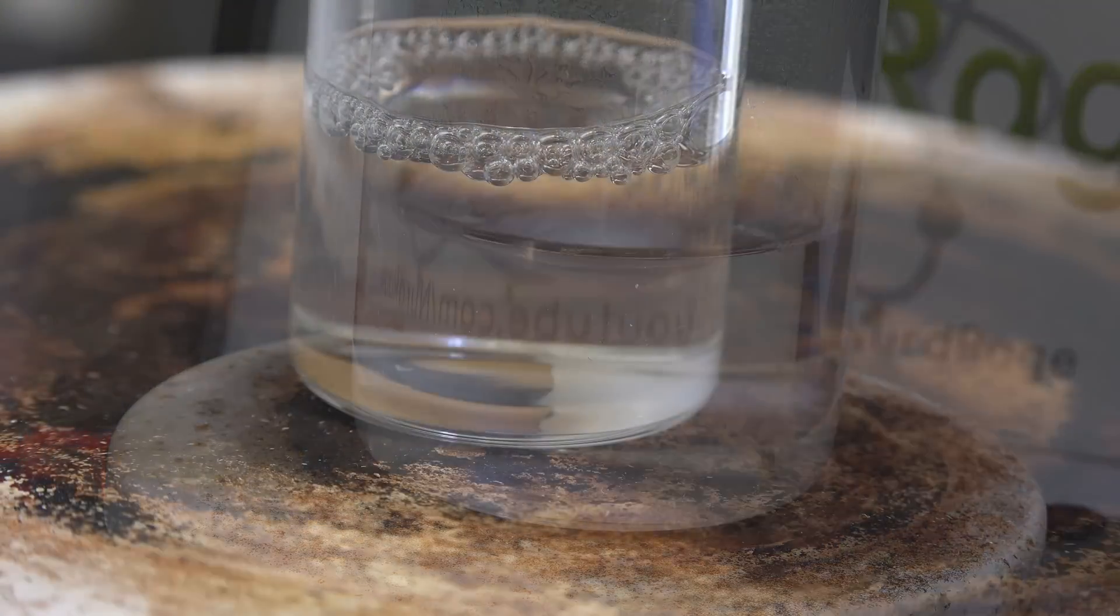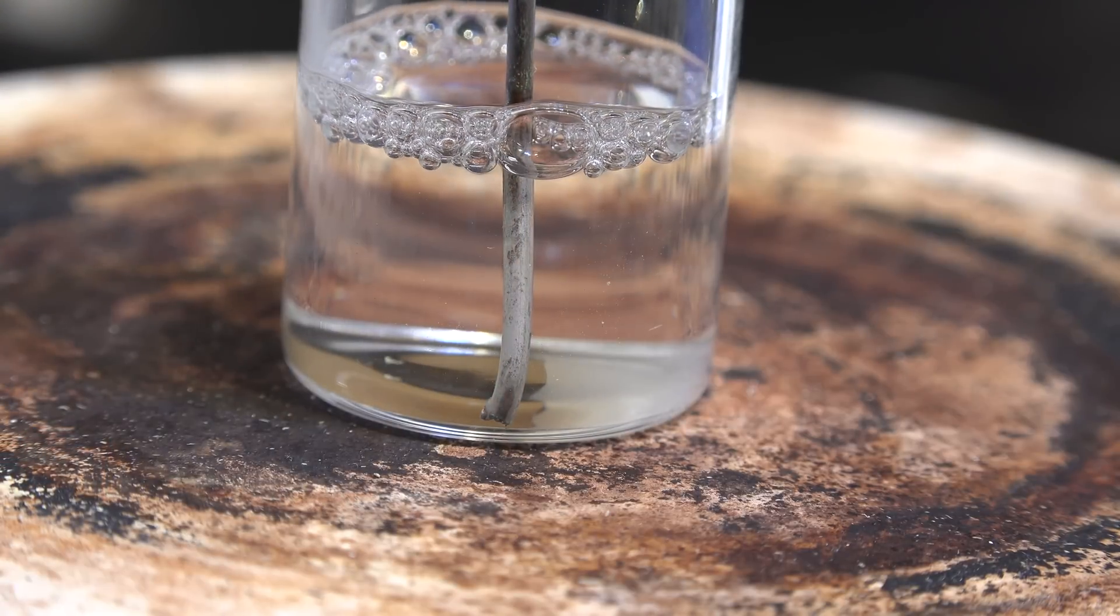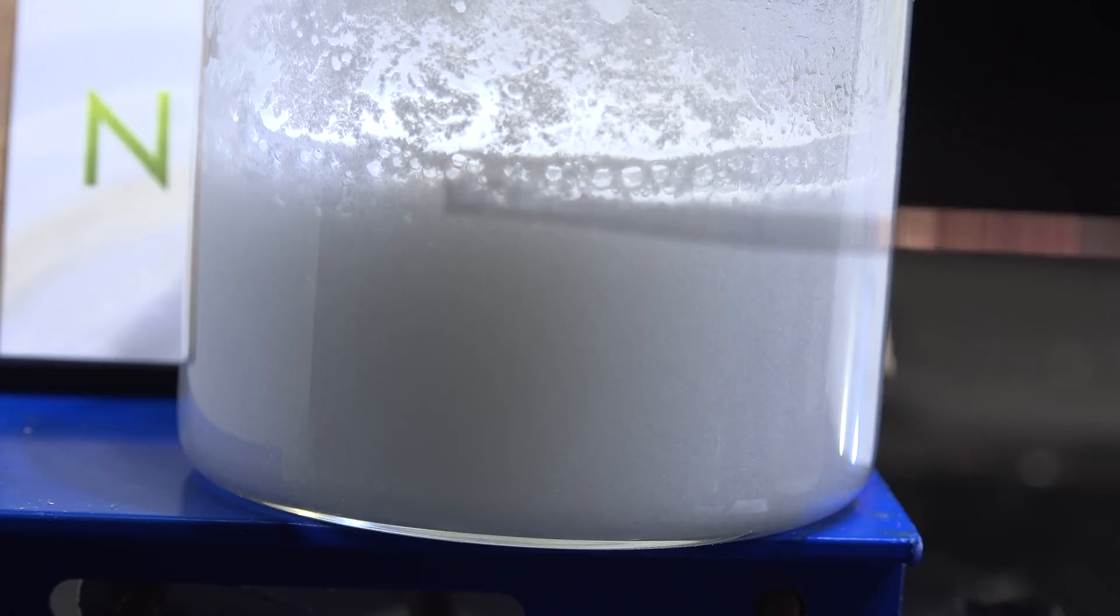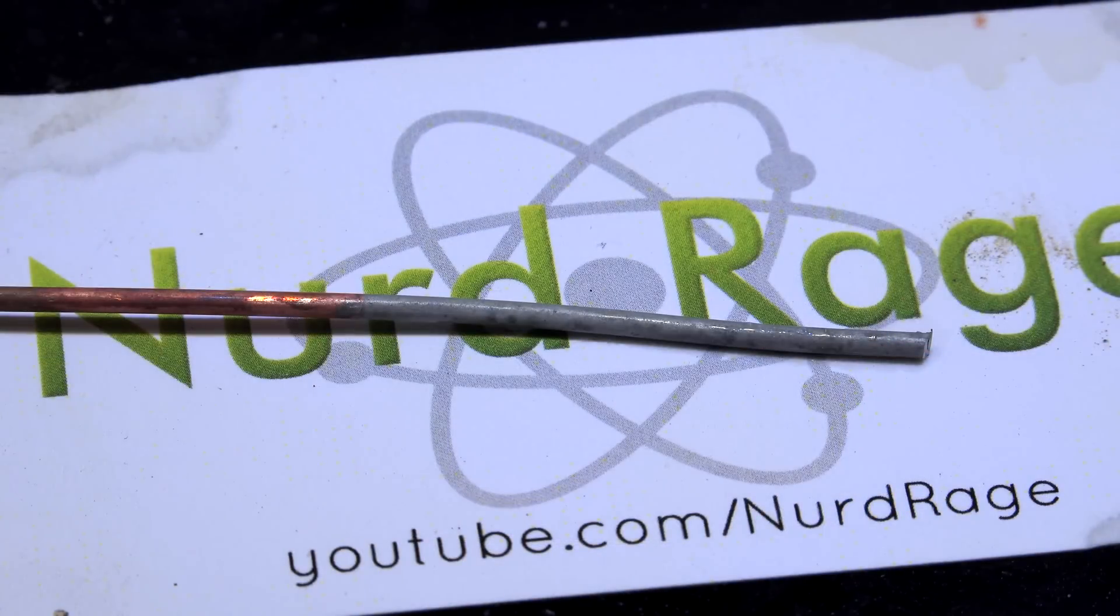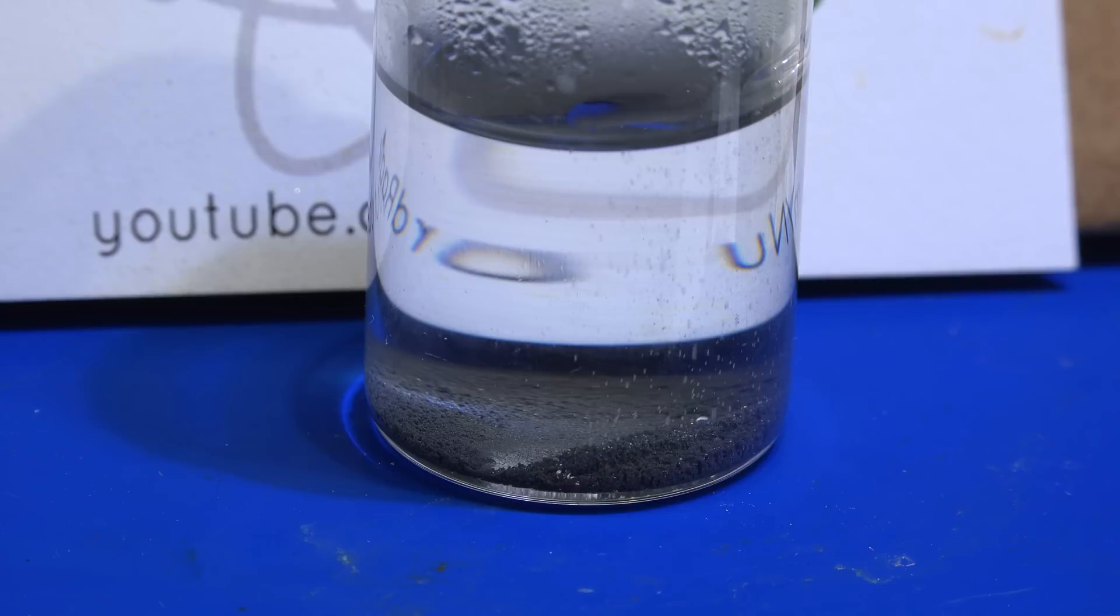Now it works much faster when it's hot and you can see what's happening, but the reactions still work while the solution is cold and precipitated. So you can do this entire process by hand without a hot plate if you desire. The only equipment you need really are beakers or jars.